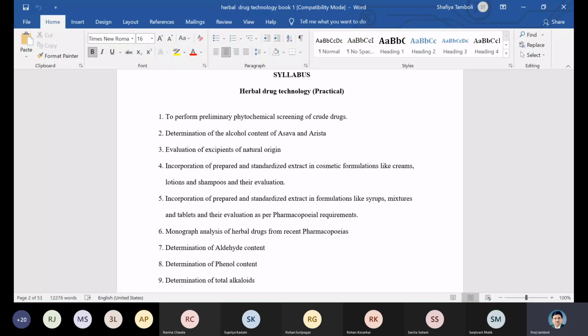Okay, then again the same plant material, you go for the second solvent, say for example n-butanol. Again go for the extraction, the complete entire process. Again stop the process, remove the RBF. Whatever extract comes in that, then remove the plant material again, dry it. So like that you continue this process up to the alcohol.